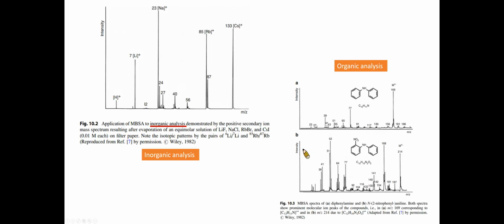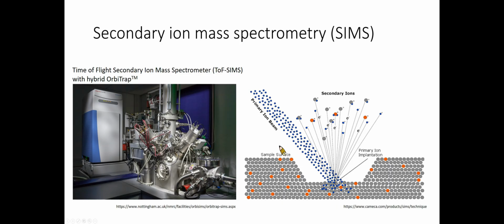Here are some examples for molecular beam solid analysis. MBSA can be applied to analyze inorganic or organic compounds.